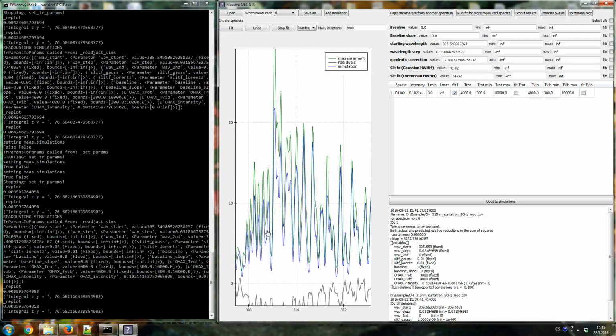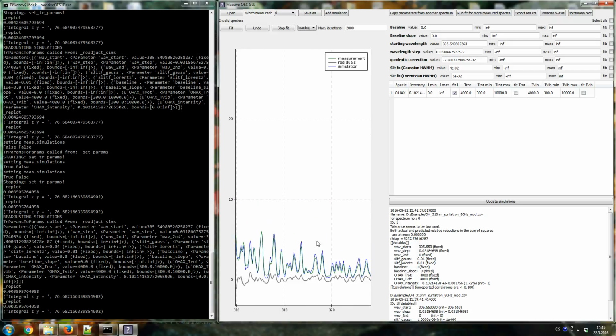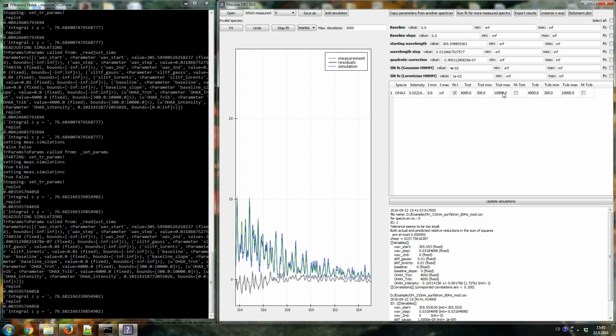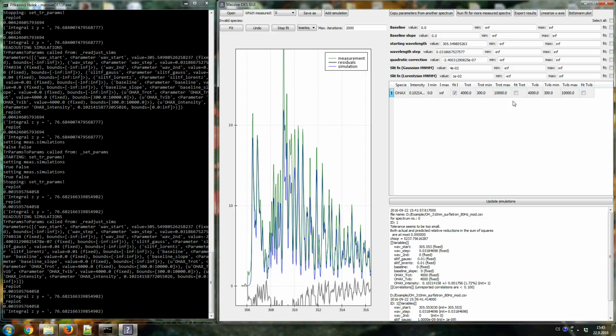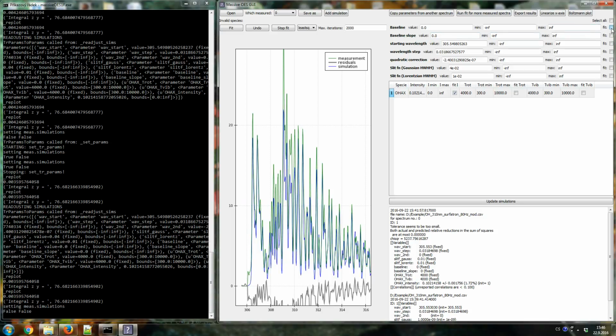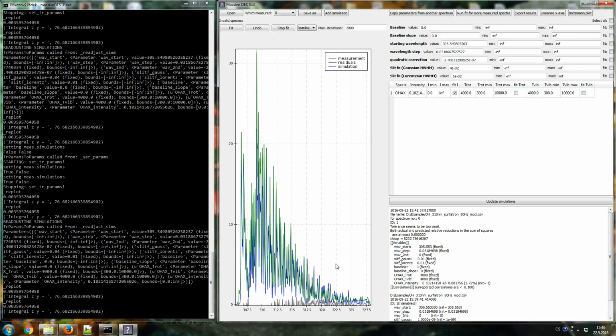We have a pretty good estimate of the slit function, I would say, and there's some estimate of the temperature, but as you have seen, I just wrote 4000, which is clearly not the best number that you can achieve. So we can now try to fit the values. So basically what I would always fit is the baseline, that's the vertical offset of the measured data from 0. Of course, you should always try to correct your measurement for all the dark currents and things like that, but usually still there is something left, so I would always select the baseline.